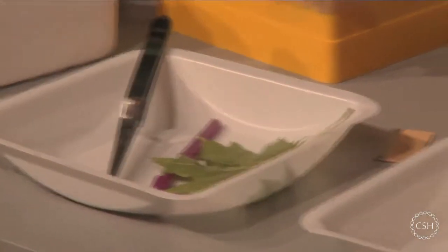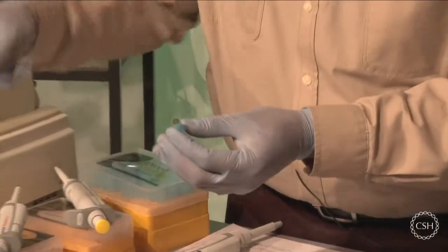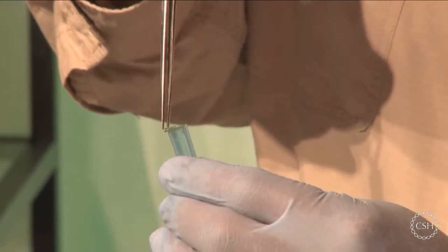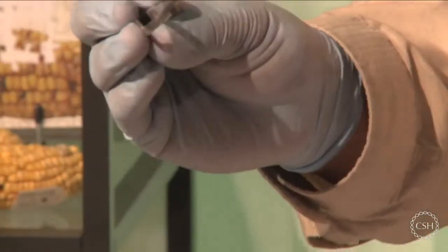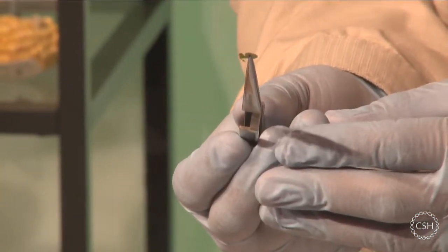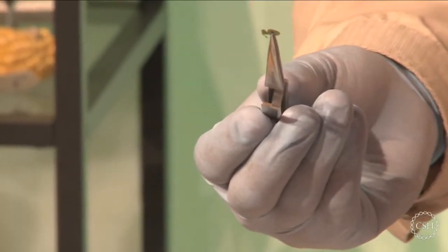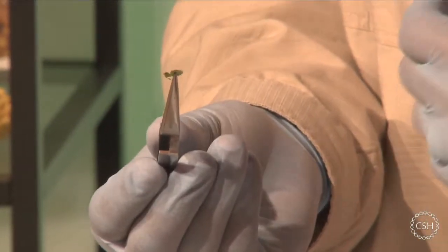Okay? So now I have a little bit of a punch of that tissue, and now I'm just going to basically go in there with my forceps and grab that tissue. There we go. So now I have my little piece of leaf, and that's all we physically need, is that little bit of a punch, okay? We don't need any more than that. Any more than that is going to be problematic. We don't want to introduce more contaminants. So the smaller the piece, the better. But this is about the right size and will lead to us getting a really good product.